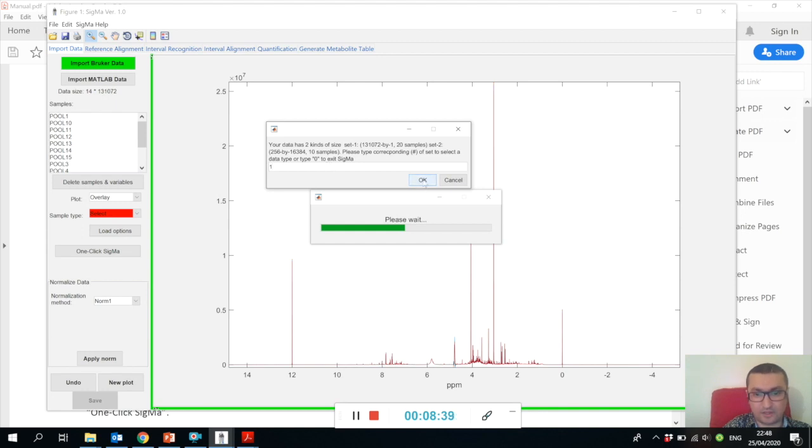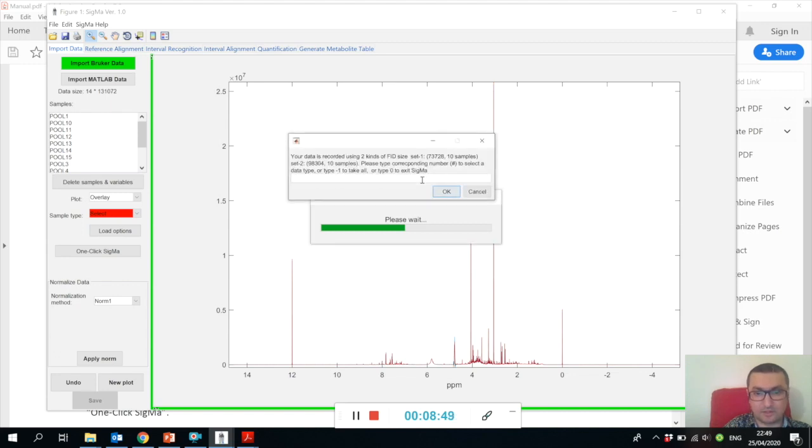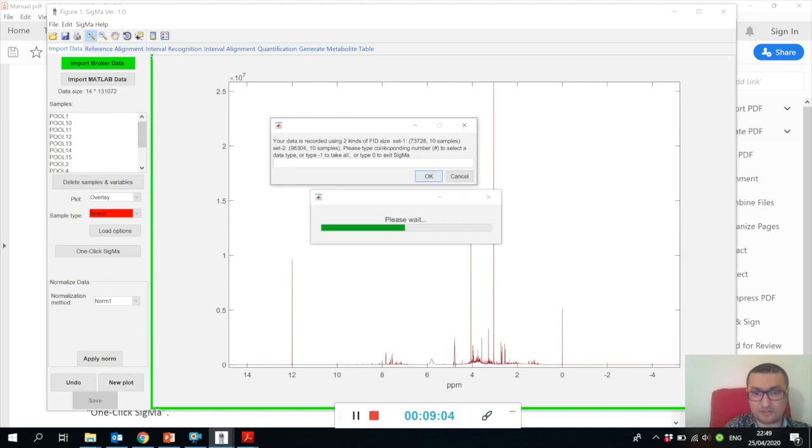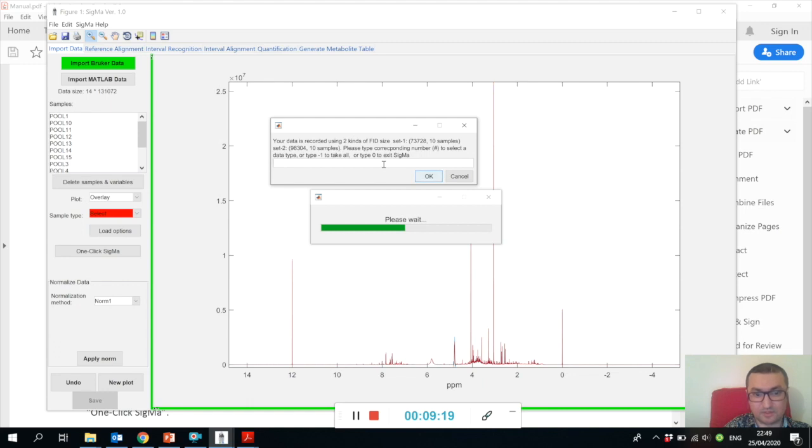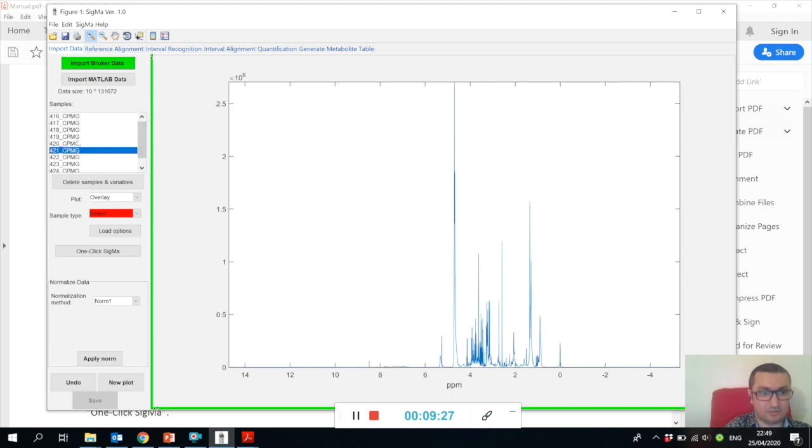Press OK if you don't want to continue and want to sort out your data files first, type zero and exit the program. Now I type one and it runs further and checks further. Within those 20 samples that we selected, Sigma finds that this data has been recorded using two different FID sizes - 73,000k and 98,000. I know by experience that set two corresponds to the NOESY spectra and set one corresponds to the CPMG. Let's open just CPMG - type one, press OK - and now you can see I opened 10 CPMG spectra.